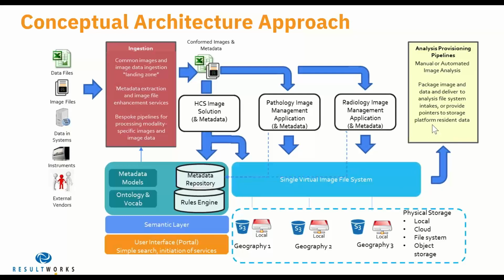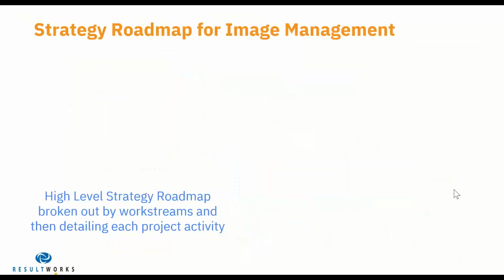And then on the output side, we were able to develop various pipes that would pipe images into the analysis tools of choice by the researcher or scientist doing whatever kind of image analysis was required. So that's a quick overview of the architecture.